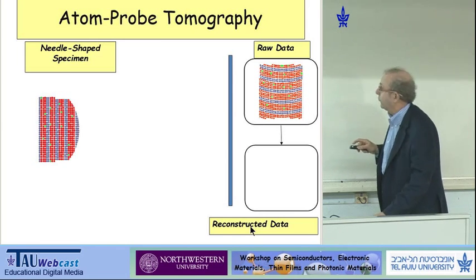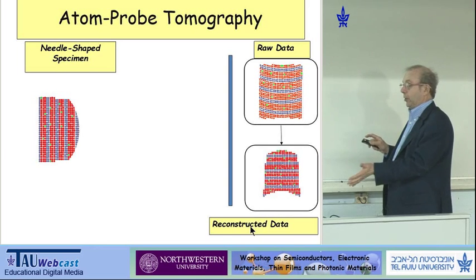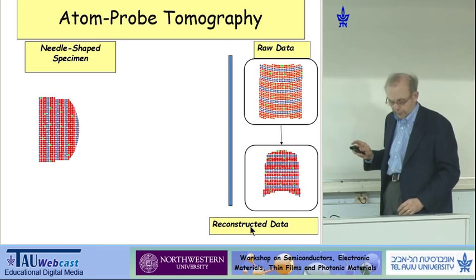And then you reconstruct. Basically, you level the planes out. And this is what you see on the monitor. And when you transfer the data set to a workstation, you can rotate it continuously, okay?